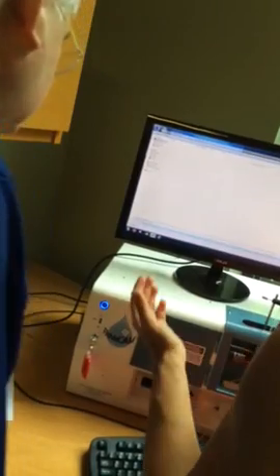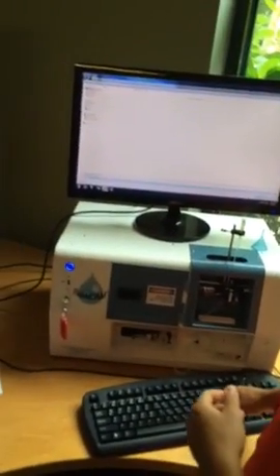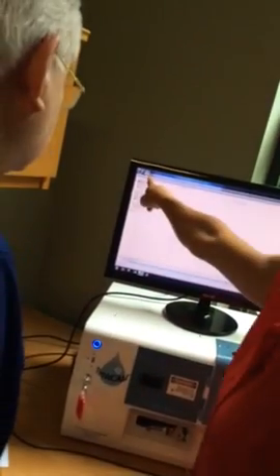Great. So, however you want to differentiate your data runs, and we're going to save that list file name under high-tech under 4x 300. Exactly. Cool. As soon as you do that, it starts.